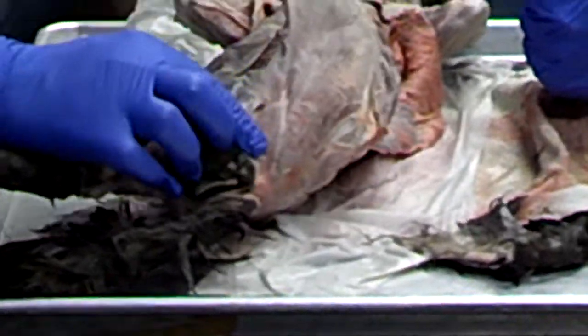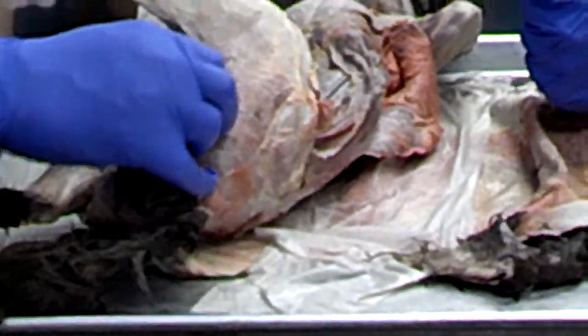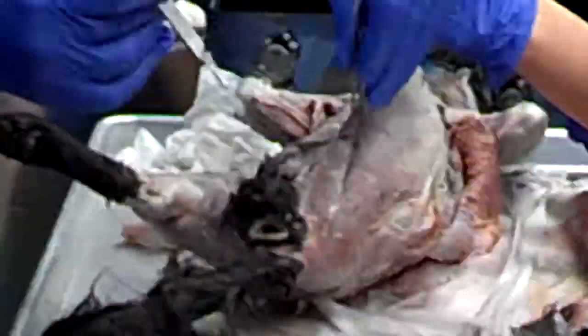The semitendinosus you could see from this side too. It's a pretty long muscle right here. So you can separate it from this side too. Later on we'll separate it from the biceps femoris, you can hold it. You can separate it here from the biceps femoris, right there.